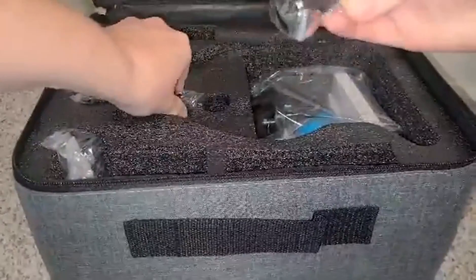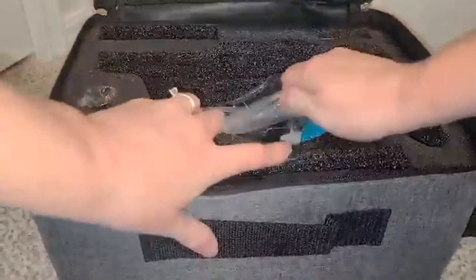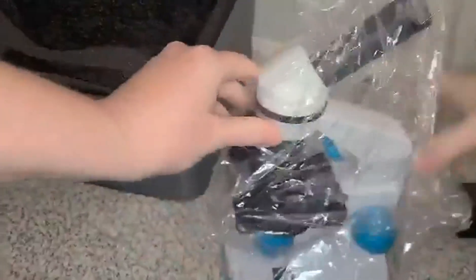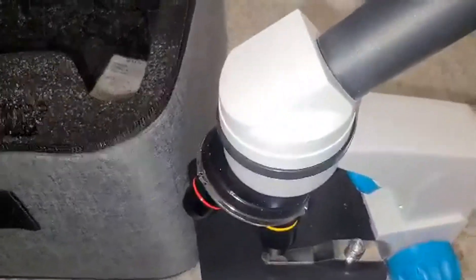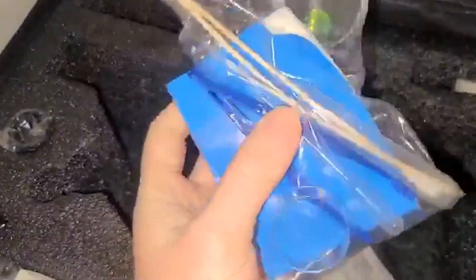Then you've got your little magnification pieces here, and the microscope itself is actually quite compact — you can see what it looks like here, very cool. It also comes with some slides, which is nice.